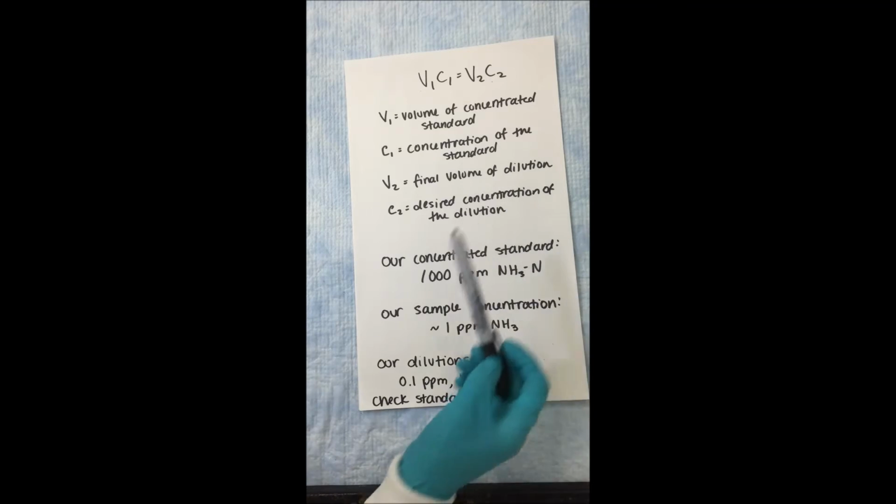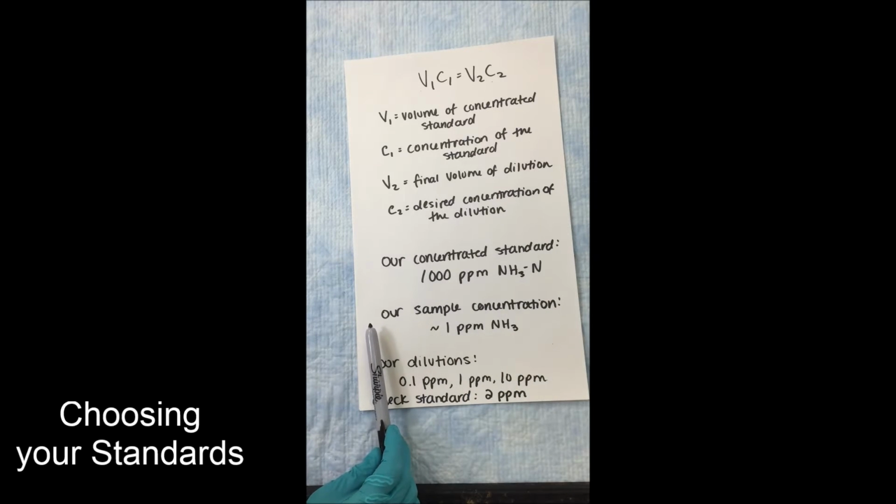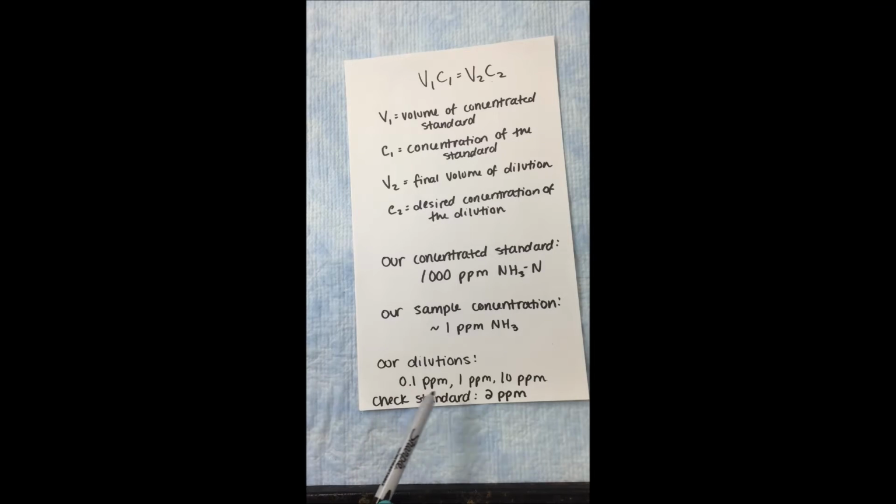Using our concentrated stock standard at 1,000 parts per million ammonia, our samples are going to be around 1 part per million, so we are going to bracket our dilutions at 0.1, 1, and 10 parts per million ammonia, with a check standard at 2 parts per million.